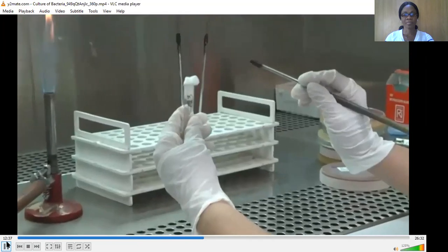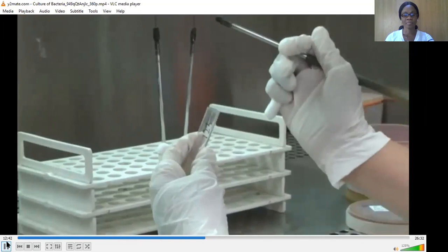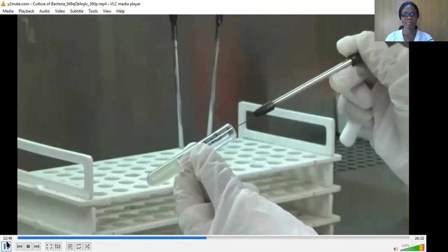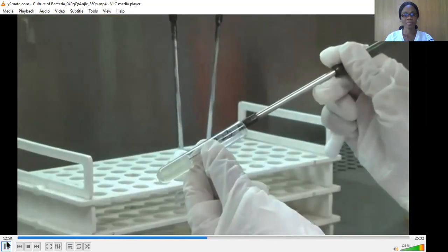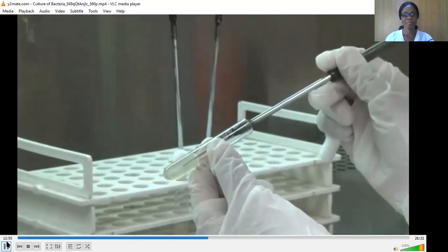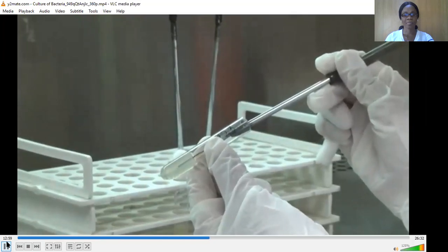Hold the agar medium in your left hand and remove the cotton plug or cap of the agar medium with the little finger of your hand and flame the neck. Then, plunge the loaded inoculating wire into the center of the medium in a straight line, taking care to withdraw the wire in the same line to avoid splitting the medium.